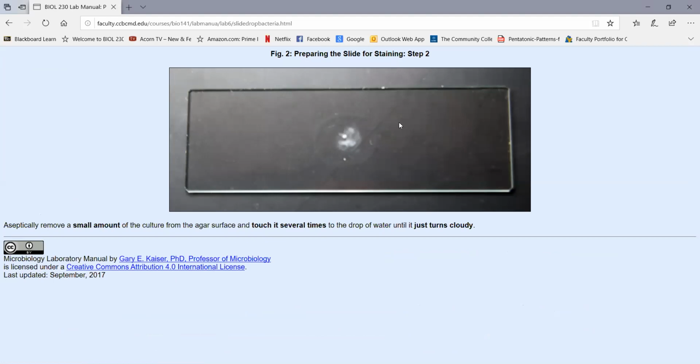And again, if you have them piled on top of one another, you're not going to be able to decolorize properly. But if you have too few, because there's so few bacteria losing dye, you might actually over decolorize. So the amount of bacteria is really critical in a good gram stain.